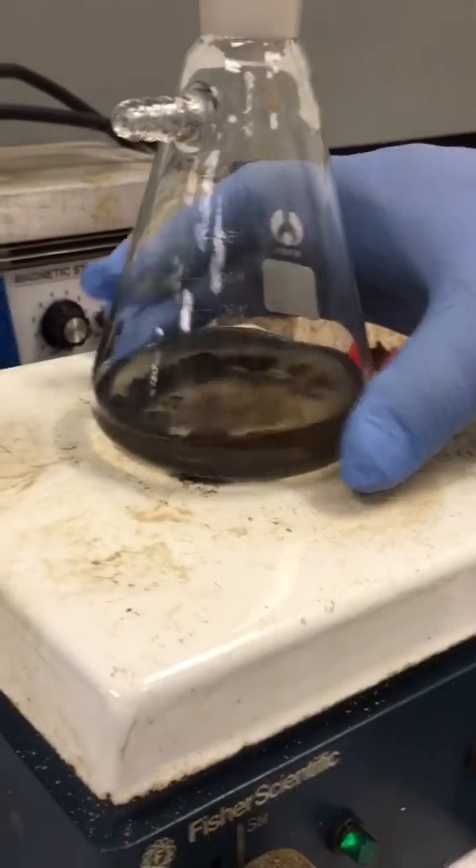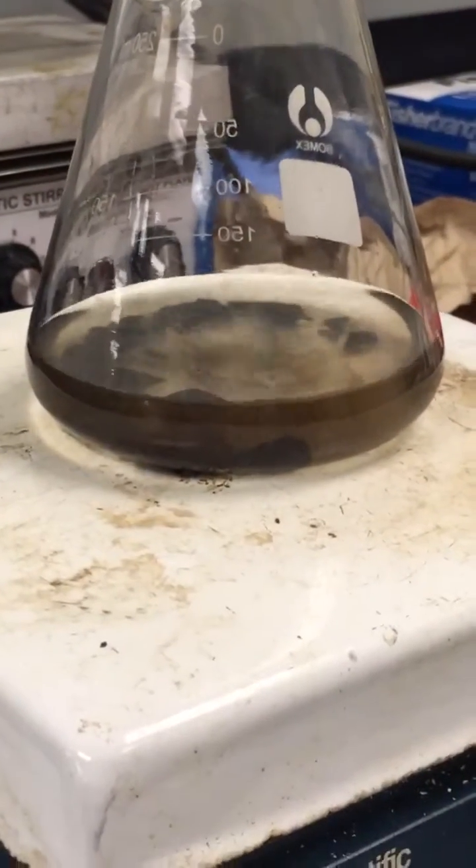The temperature of the liquid catalyst is still cool — I can still pick up the glassware and hold my hand on it. There's no surface temperature to the glassware or the liquid catalyst.